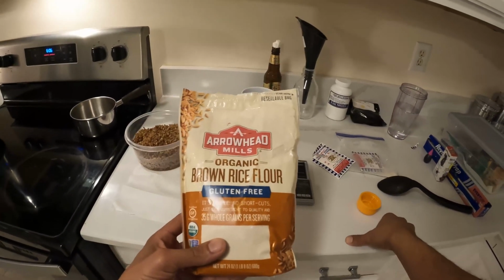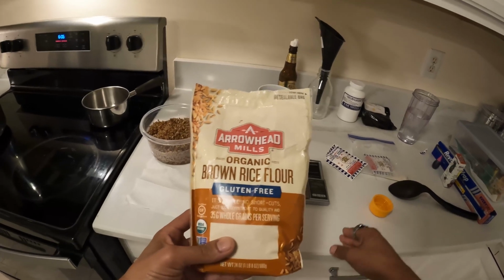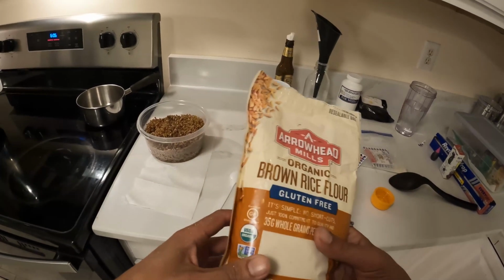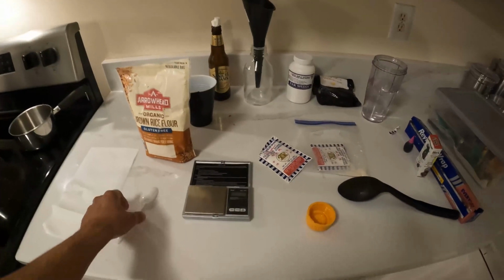Most typical agar recipes call for 20 minutes. If you're using grain or brown rice flour, you want to go ahead and push that to 25 minutes, 30 minutes tops, so that you make sure that everything's properly sterilized. So let's go ahead and get that out of the way.